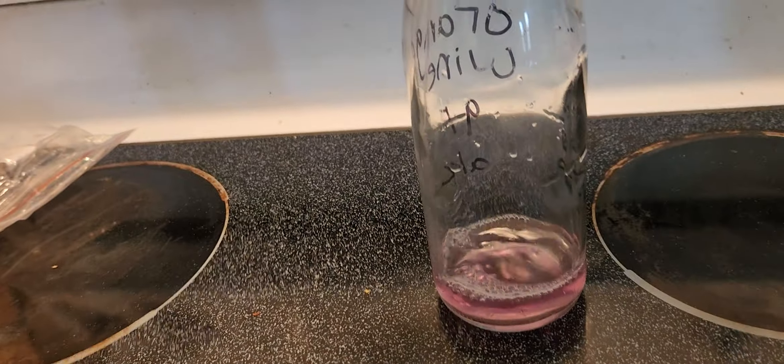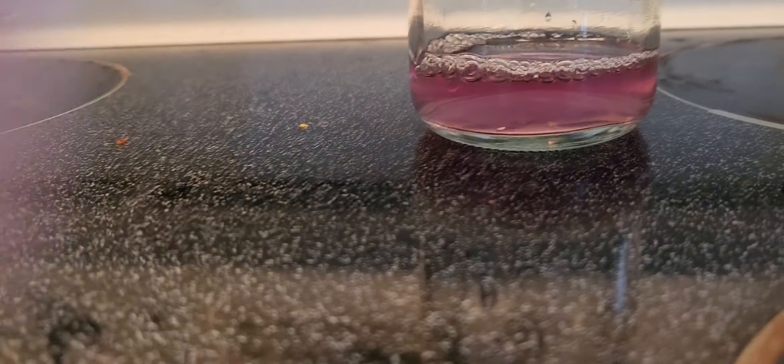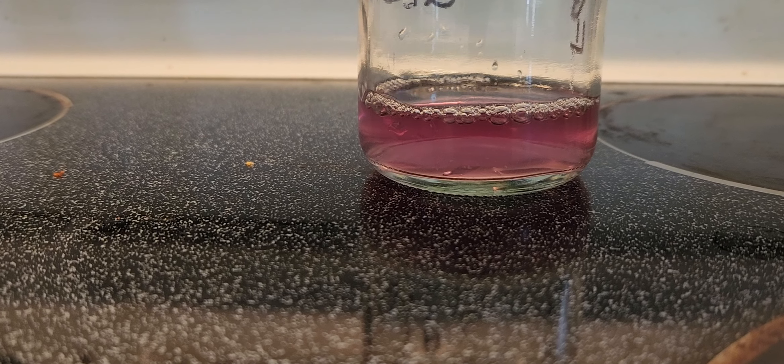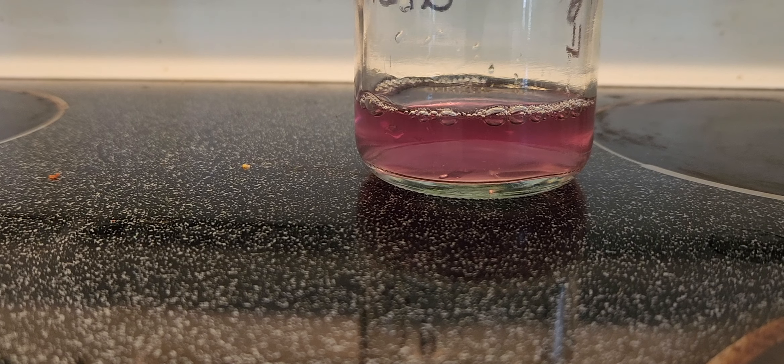It's a little acidic, if you want you can neutralize it with baking soda, but I'm not going to do that for now.